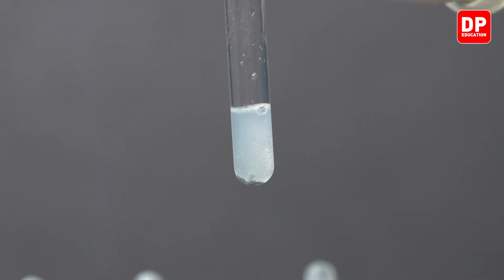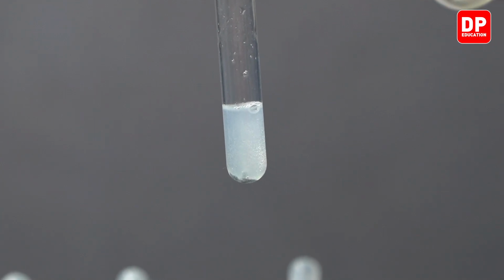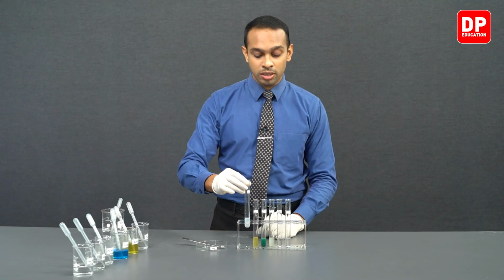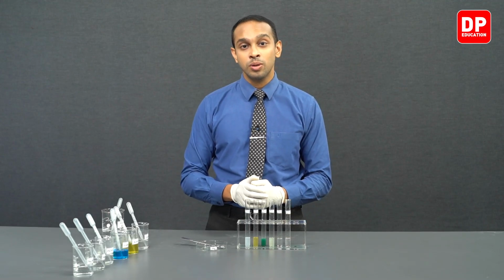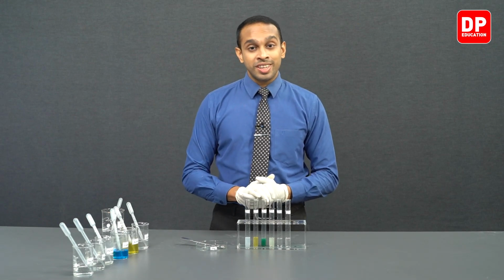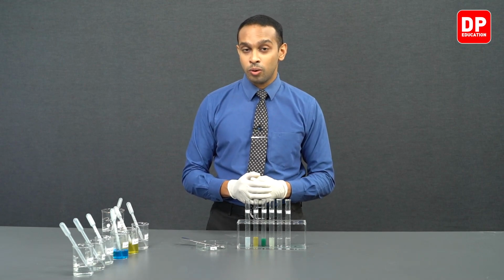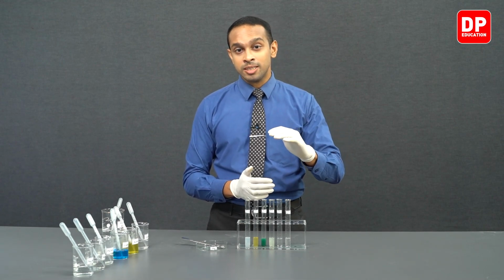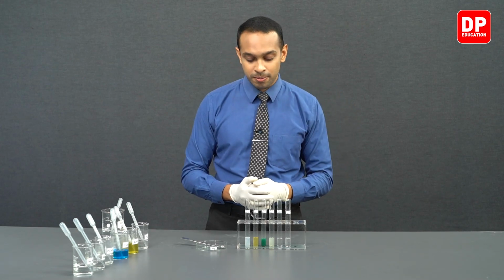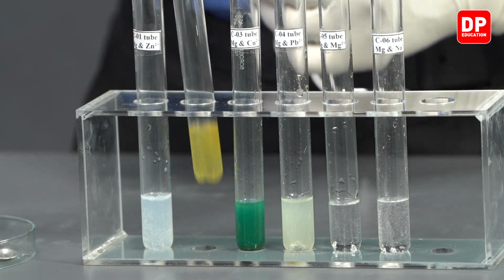That indicates magnesium has reacted with zinc 2 plus ion solution and has displaced zinc 2 plus ions as zinc solid, and magnesium has turned into magnesium 2 plus ions. So we can conclude magnesium is more reactive than zinc, or in the reactivity series, magnesium is found above zinc.